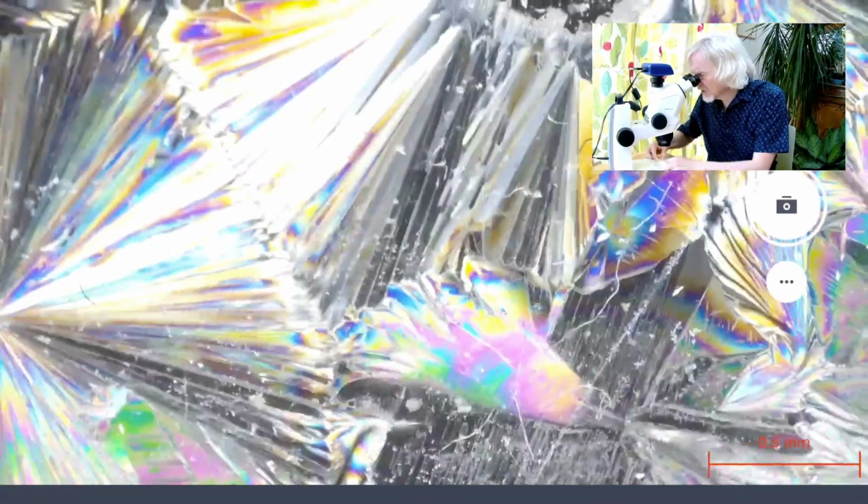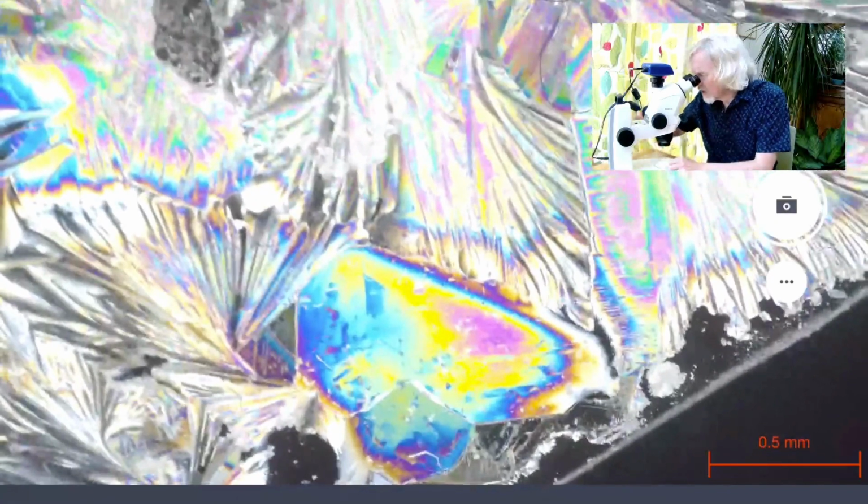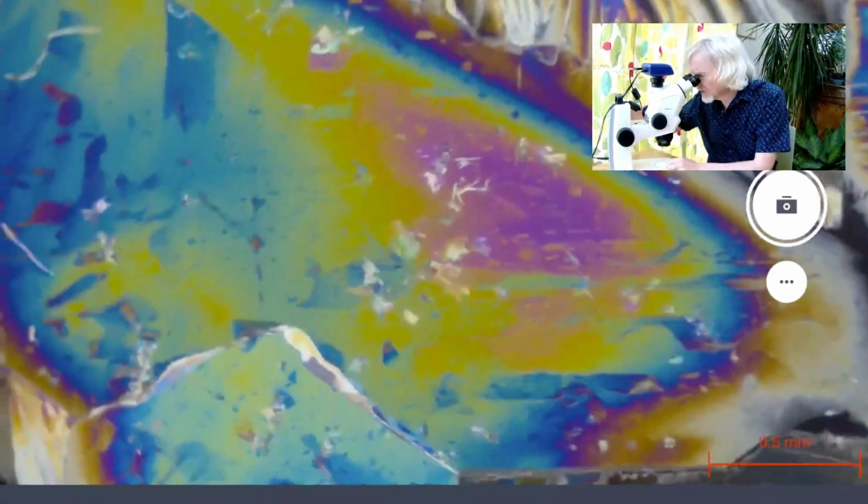Now, there's another section. Where's a good section? There's a bit here. Sorry, that's my phone bingly beeping. I should have turned the sound off. Here's a good bit here.